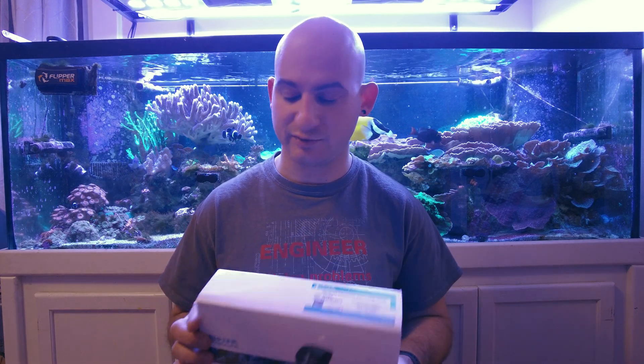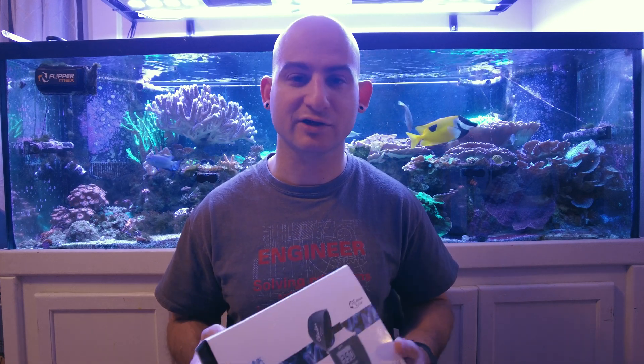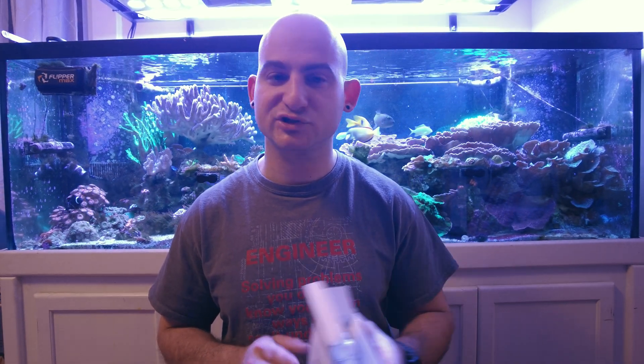I ordered the Hanna from saltwateraquarium.com — mostly because I like the Hanna Checkers and use them for almost every other test possible, so I figured why not keep it in the family. The other suggestion, the ELOS kit, I ordered from melevesreef.com — thank you Mark. It came highly recommended and it's a regular manual test, as opposed to something more automated.